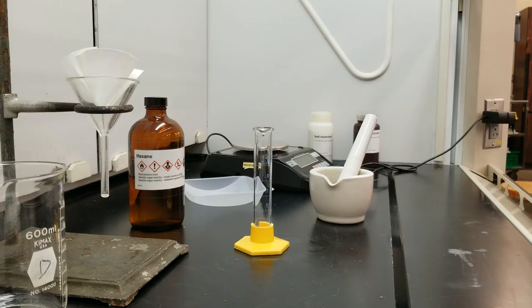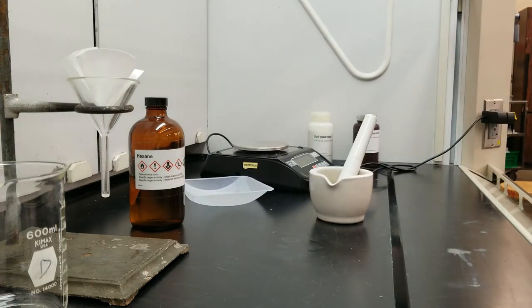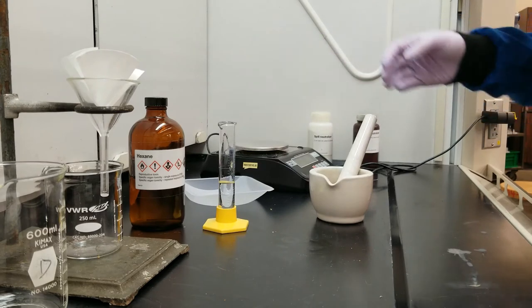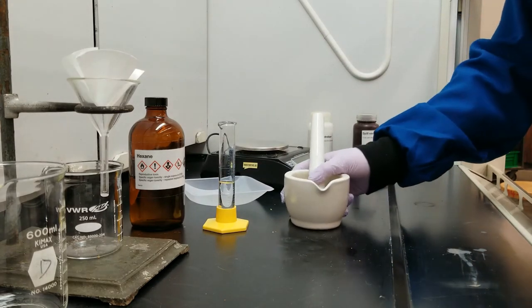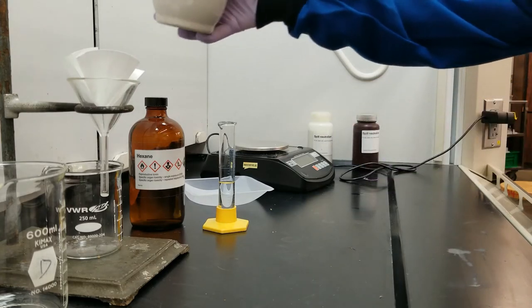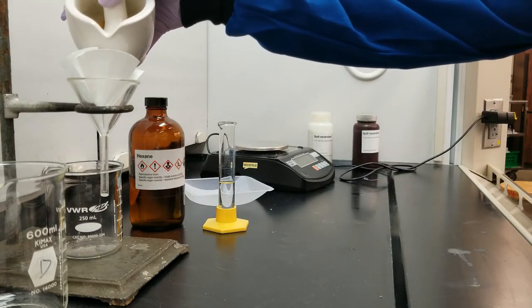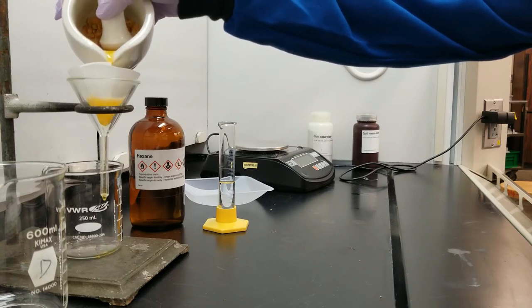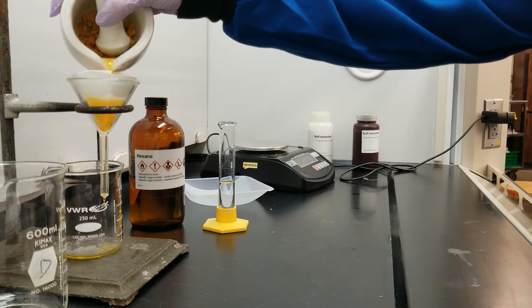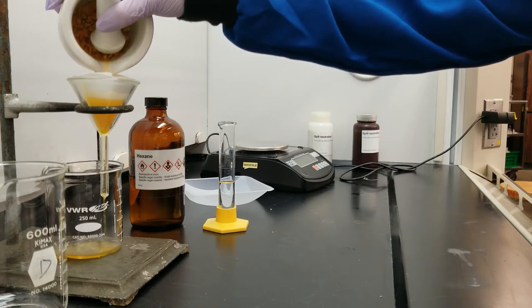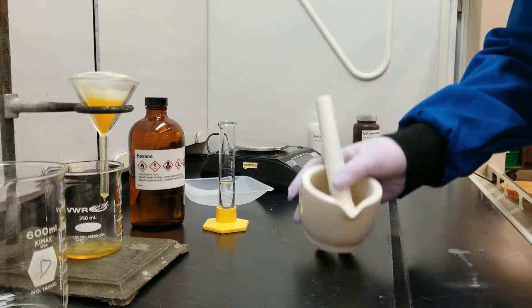So I'm going to pour off the hexane from my potato chips into my funnel. I'm going to try not to lose any potato chips. And while that's filtering, I'm going to add another portion of hexane to my potato chips.